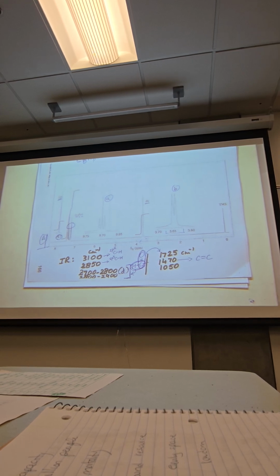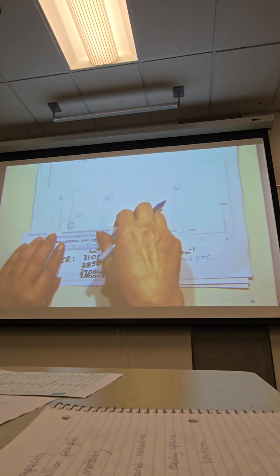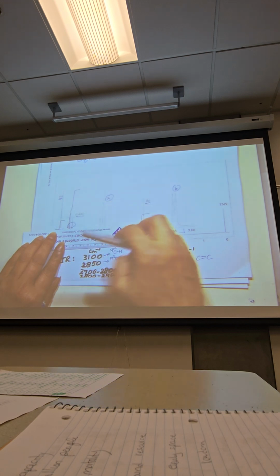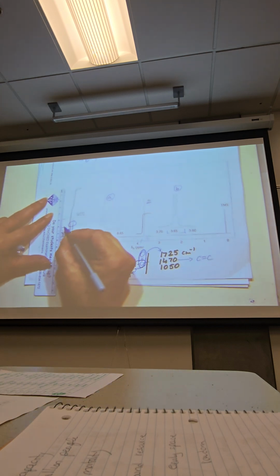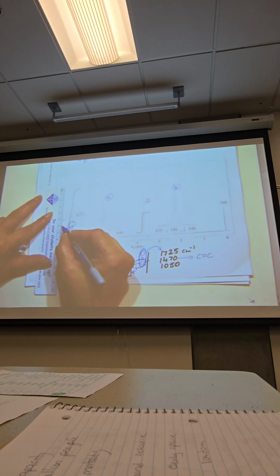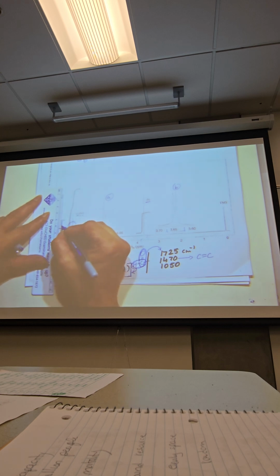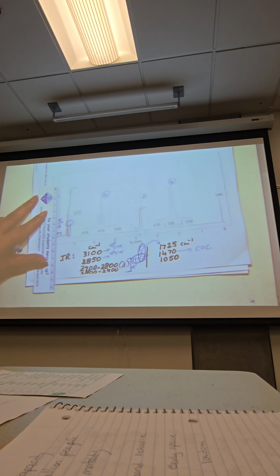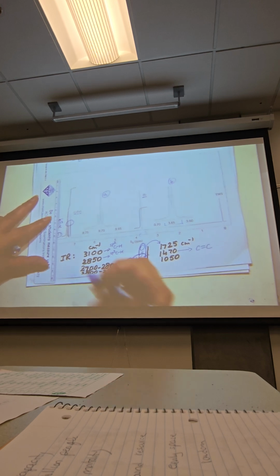Okay. So for signal A, I'm going to measure this distance, right? Yep. So 10, 13-ish. By the way, we should always take that with a pinch of salt because sometimes we have to adjust it. Maybe it's not 13, maybe it was just 10, but it measured 13. So we have to be a little flexible with the integration part.